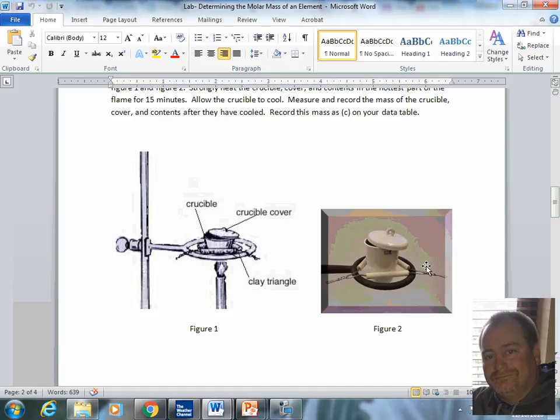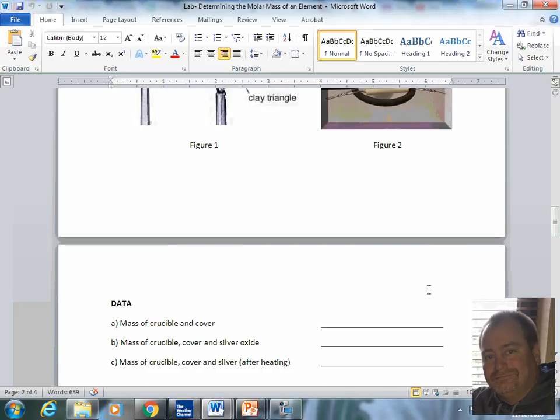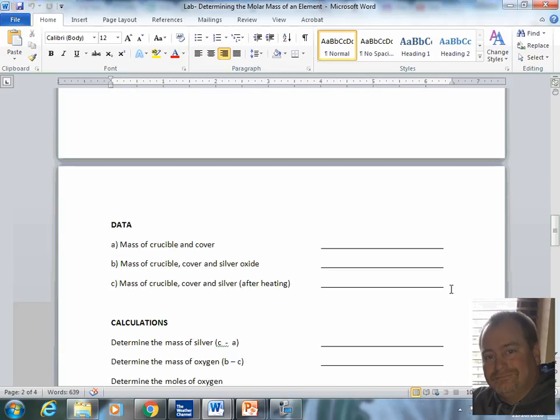And what could happen is that lid could fall off. Well, the natural reaction is to try to catch the lid before it hits the table or the floor. Well, the lid is very hot. That could result in a burn if you try to catch it. So if your lid would happen to fall off or slip, don't try to catch it, please.